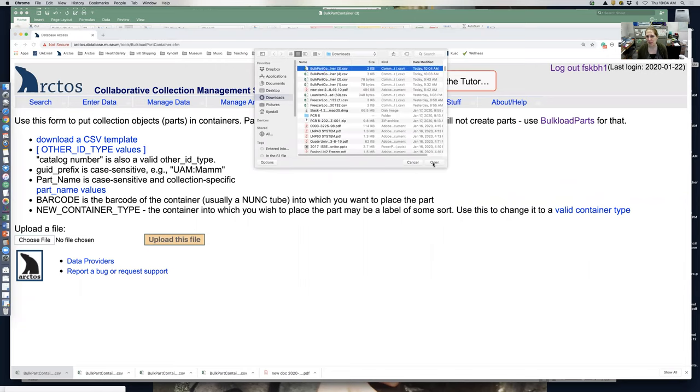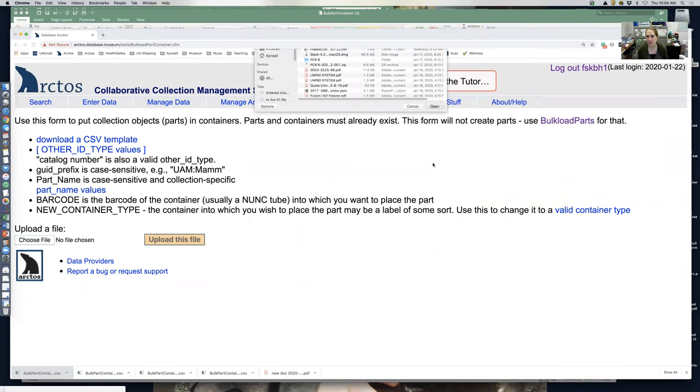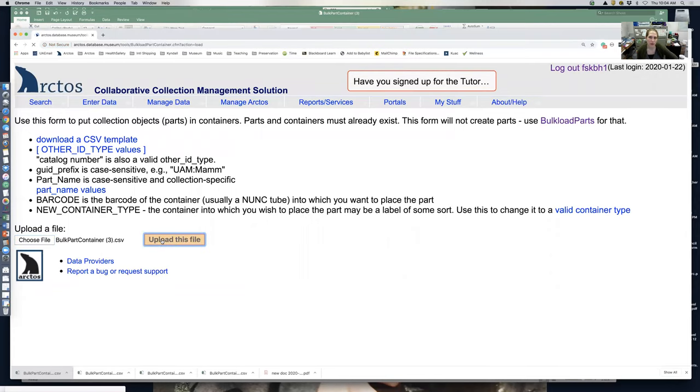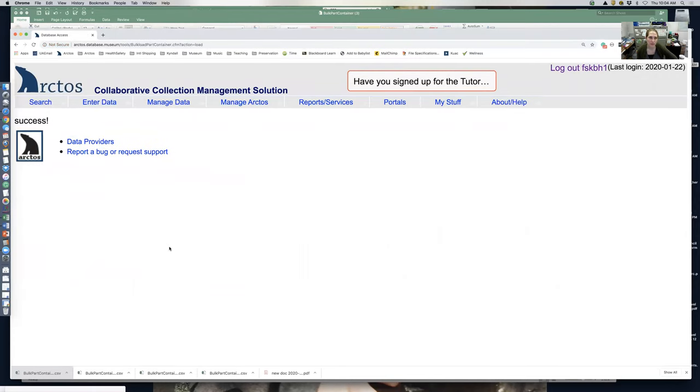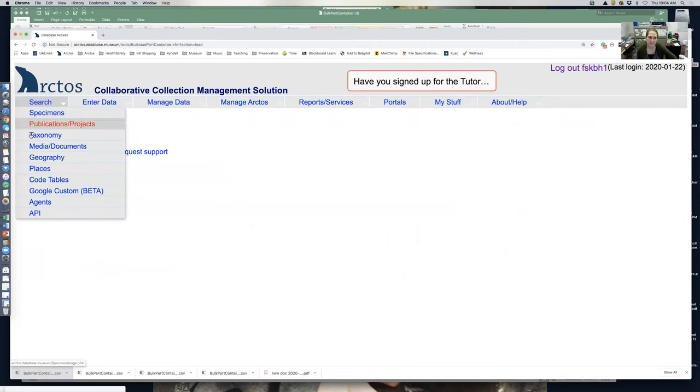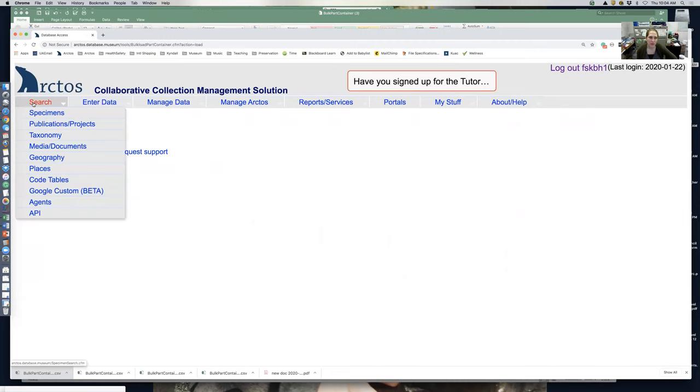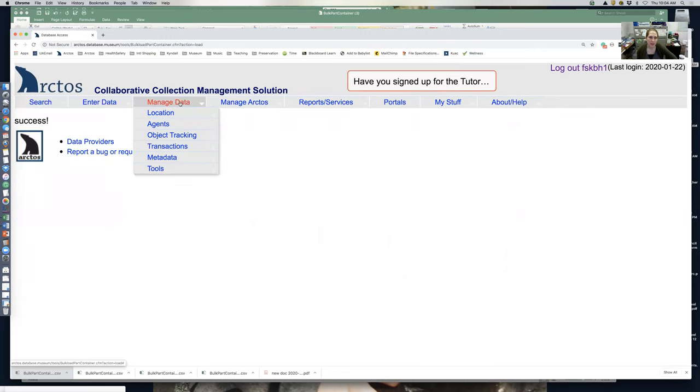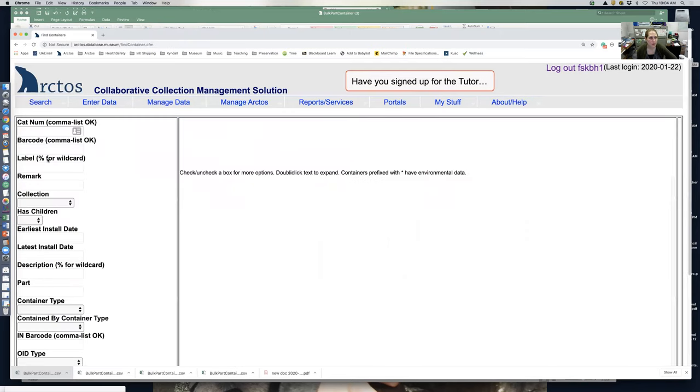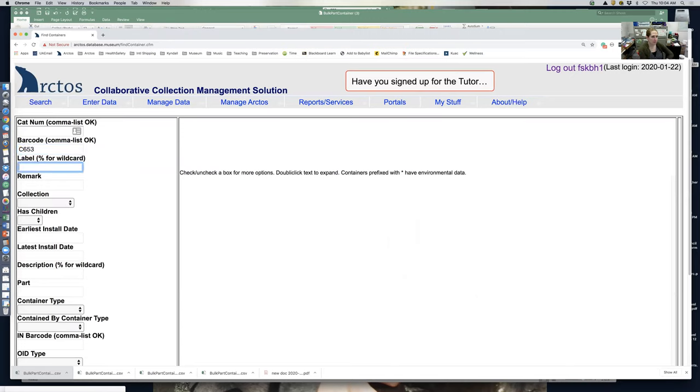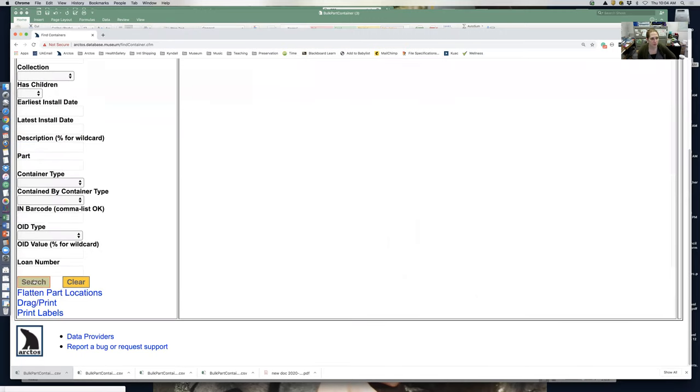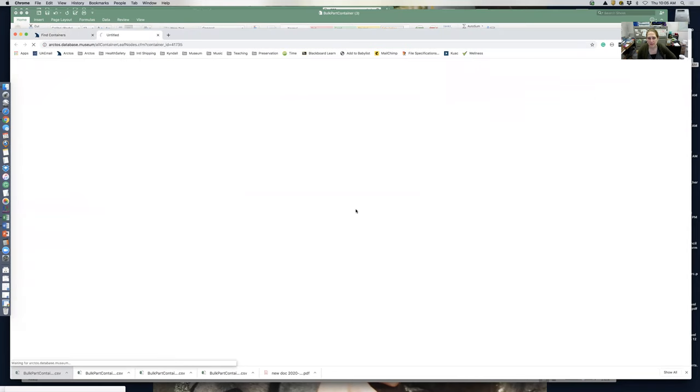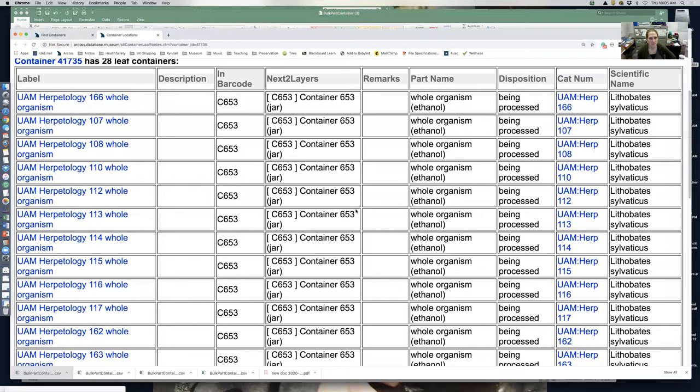Upload this file and hopefully there's no error... success! Now if I go to object tracking, find container, and scan in my container, it should tell me all the collection objects in this container. And there they are.